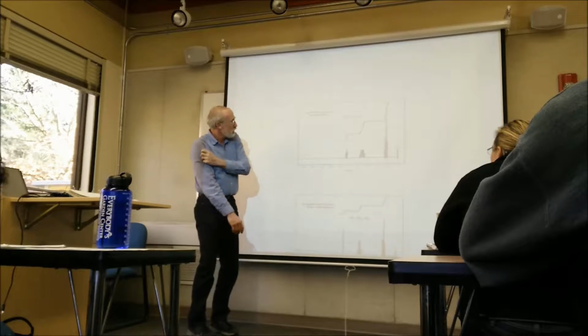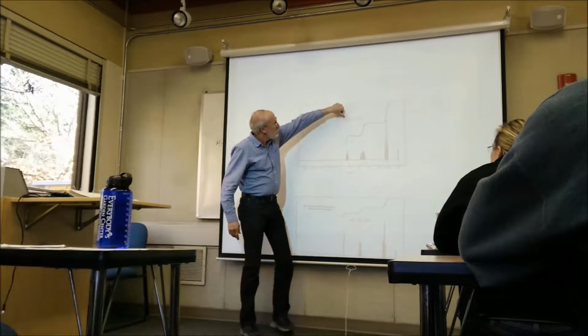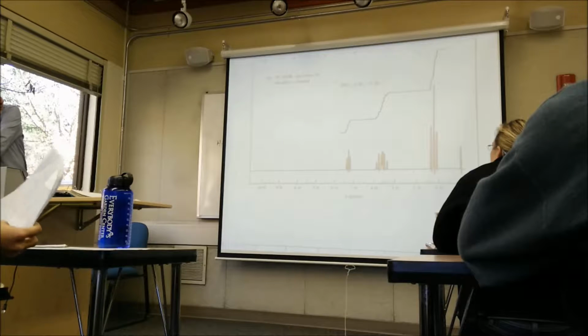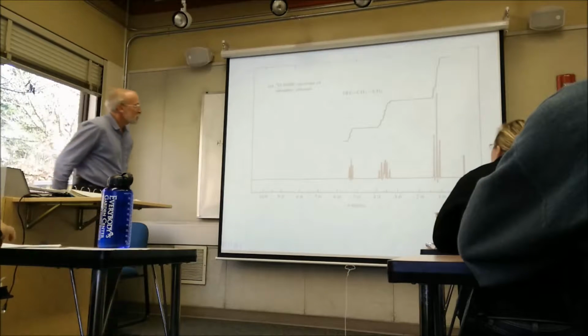Spectrum of ethanol. And what I want to focus on, there's the hydrogen on the oxygen. And you'll notice, it still isn't very well focused, is it? You can zoom too, can't you? Yeah, I'm just about to do that. Okay, that's a little easier.